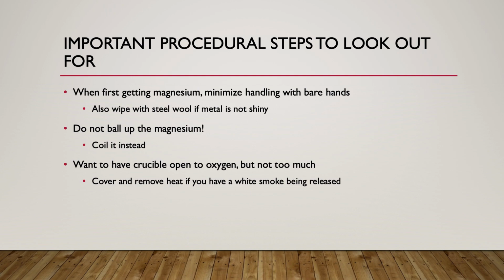At that point you've basically heated it too much, there's too much oxygen there, the reaction's going a little bit too fast, and so you're losing some of your product as white smoke, and that light is honestly so bright it can hurt your eyes or damage the eyes of others around you. So just be aware of that and careful. If you do see that really bright light, go ahead and cover your crucible up and take it off the heat, and it should be fine.